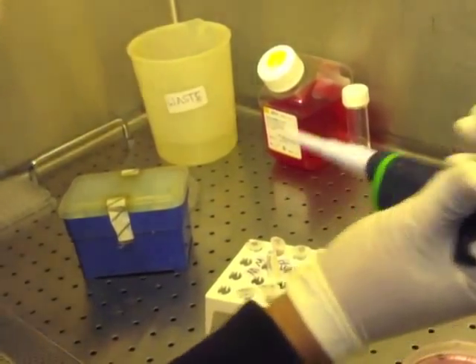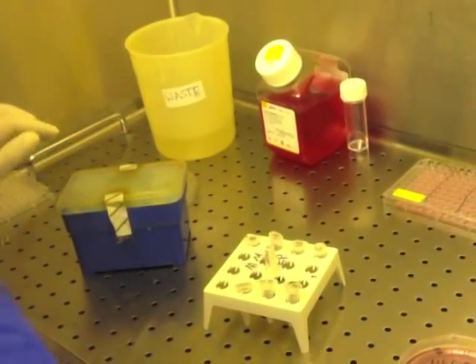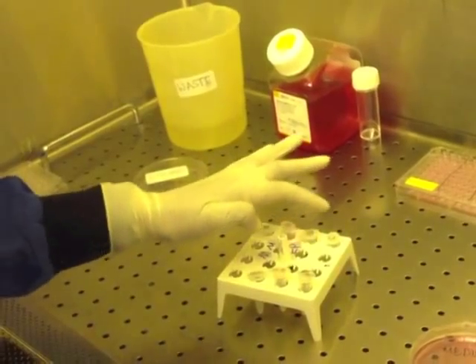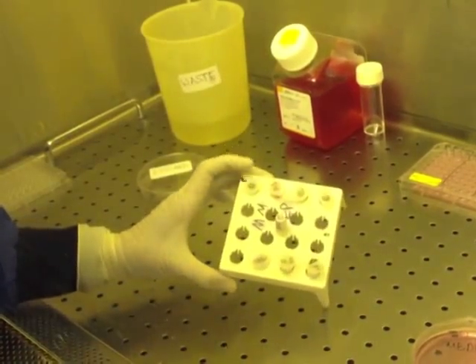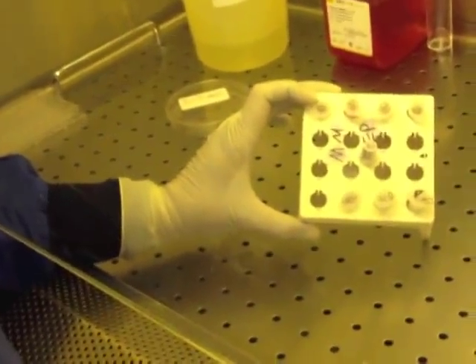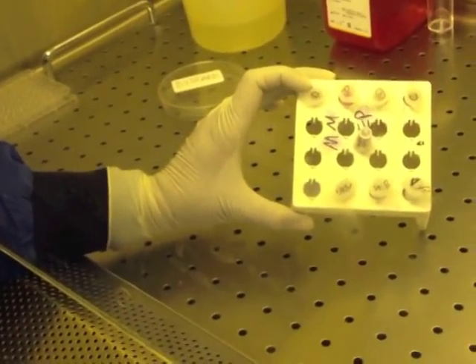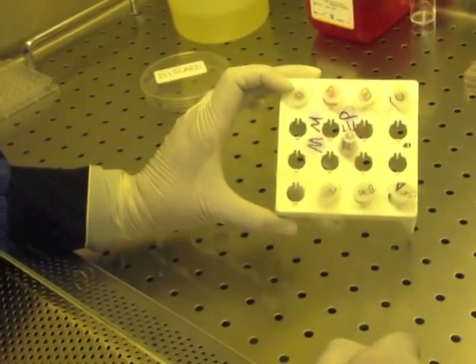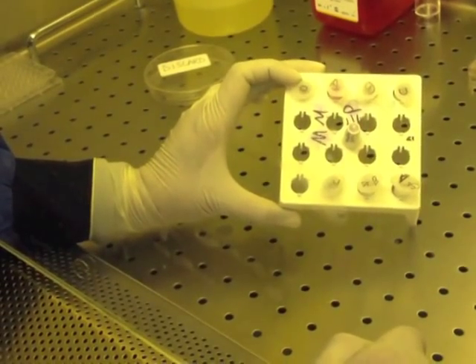Discard your tip in the waste and do the same for drugs B and C. Remember, drug 0 is medium alone, so all you need to do is take 1 ml of medium and add that to your tube 0.